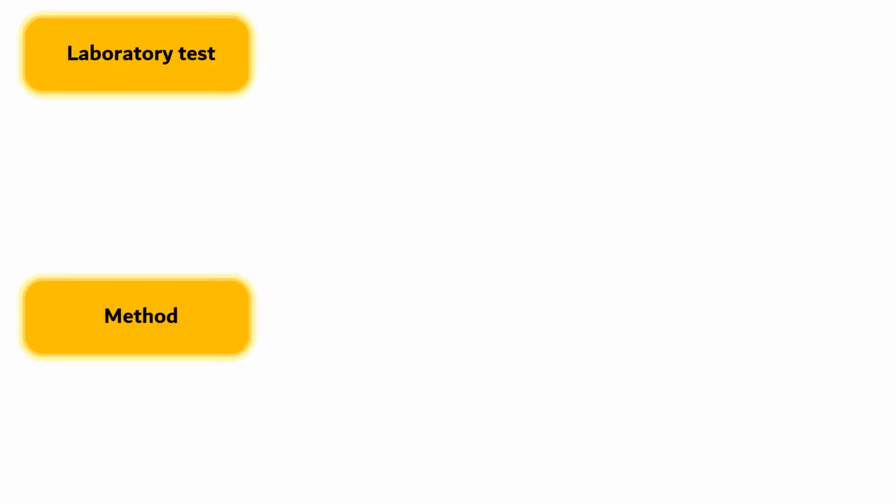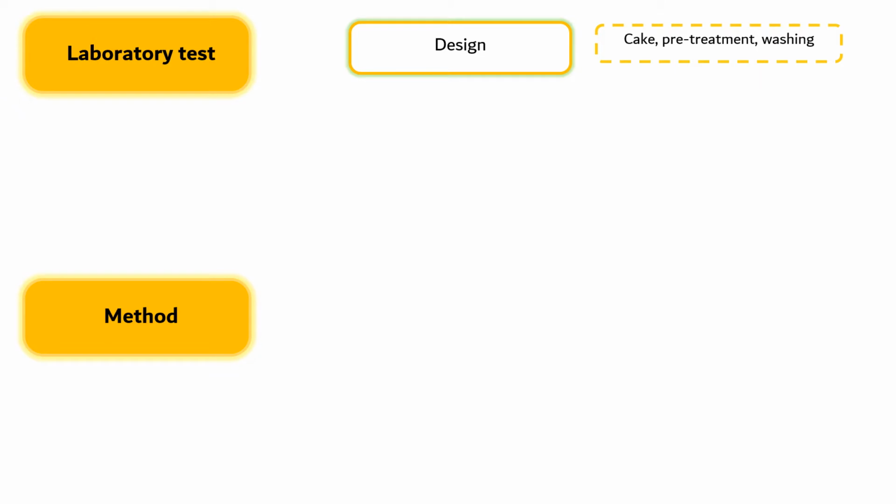Laboratory tests are very important in designing a filter to have a good filtration process, which includes laboratory tests for cake compressibility, for pretreatment, and for washing efficiency. We need to carry out these tests, but in a simple manner.